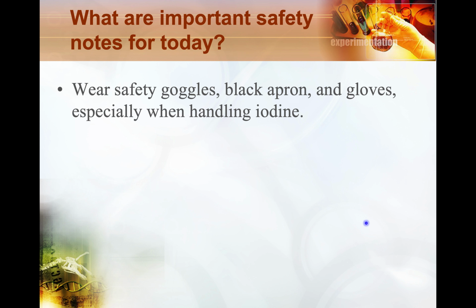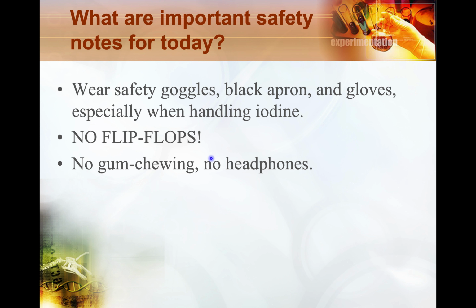For safety, it's important to wear your safety goggles. You're going to be boiling methanol, and that causes some eye hazards. Almost all of the chemicals we'll use are at least an irritant to your skin, so you have to wear gloves. You should wear your lab coats. I'll check to see if we have aprons for you. And again, because you're doing a lot with liquids, you have to be sure that you're using appropriate footwear to protect all of the skin from the neck down. No gum chewing and no headphones.